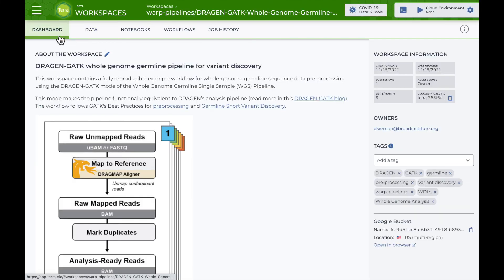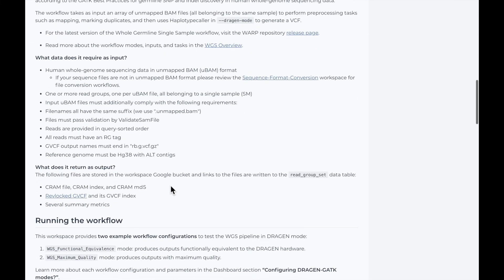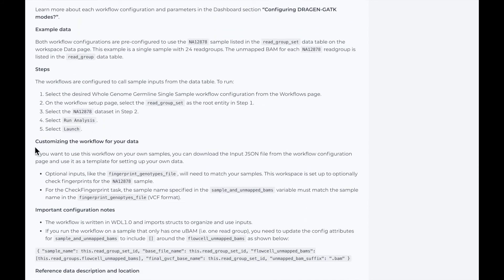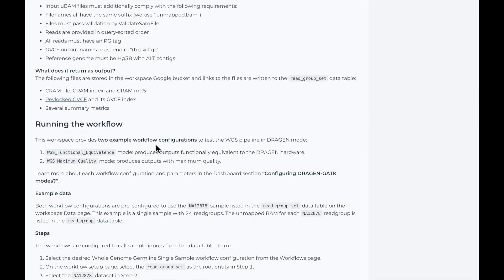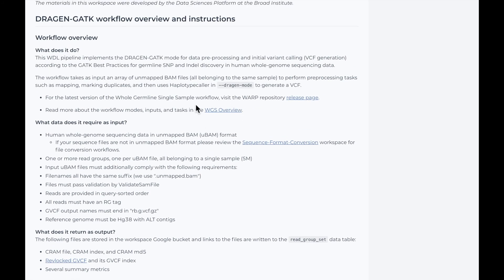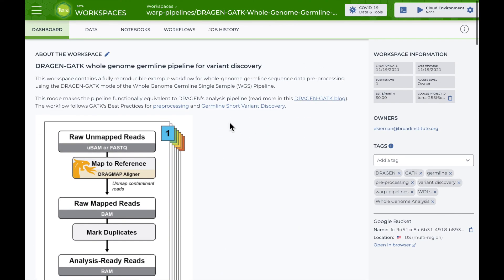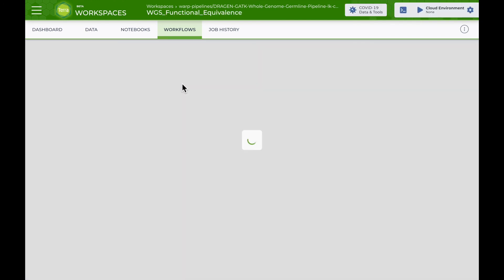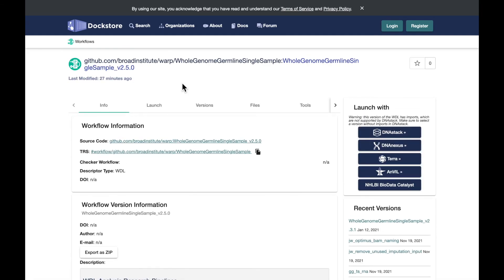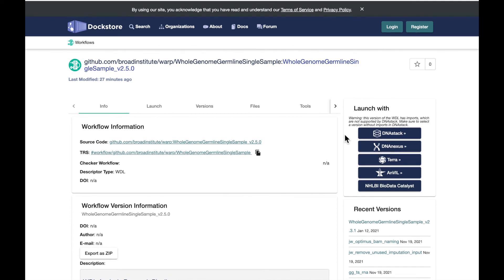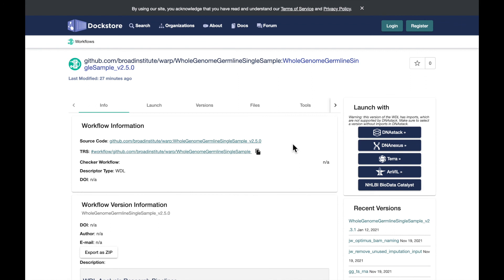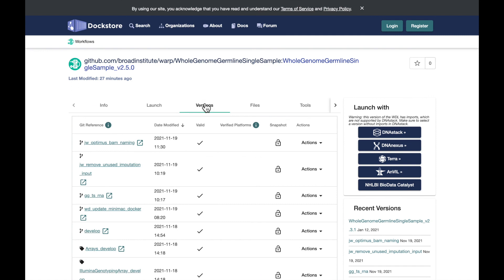If I want to customize this workspace for my own data, I can follow the tips listed in the workspace dashboard. If I want to run the Dragon GATK pipeline locally or outside of Terra, I can access the workflow from Dockstore or GitHub. The workflow source is listed on the workflow setup page. If I select the workflow source, I can see the pipeline in Dockstore. From here, I can export to other tools, view the source code in GitHub, see different versions of the workflow, or view the WDL script in the files tab.